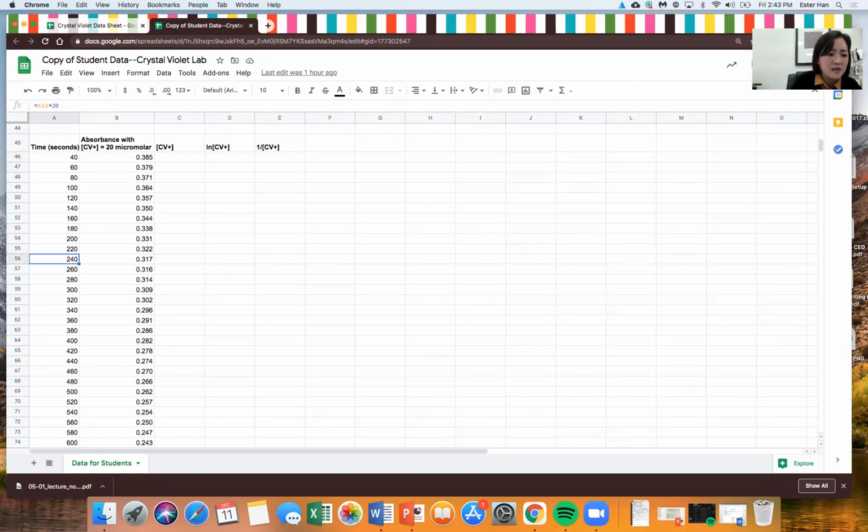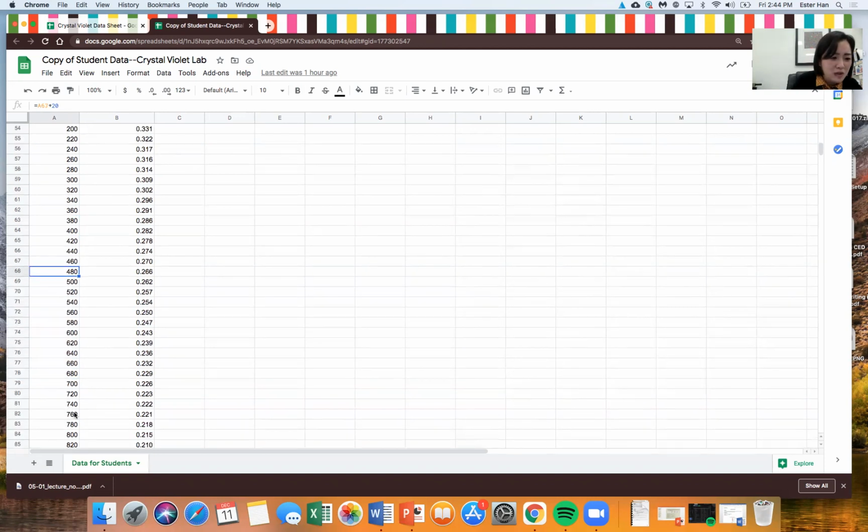There were a few instances for this part where I just kind of messed up and wasn't paying attention. So I think there are 2 points where they don't go up sequentially, like 460, 480. I don't know where it's at, but if you look carefully through the data, I missed about 2 of the 20-second intervals here, but it's okay.